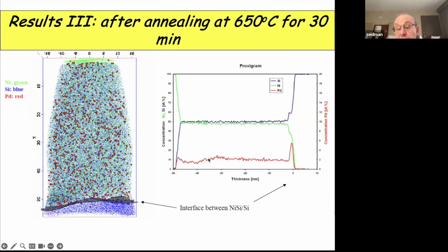And then down here is the distribution of the palladium in the nickel silicide. And all of this is what the semiconductor industry is interested in. And they're also interested in how the specimen, of course, the end product, compares. Let me reword it. They use a certain processing technique, okay? And then they get a certain result, and they're looking for an optimum result. In this case, they want nickel silicide with palladium distributed uniformly throughout the nickel silicide.